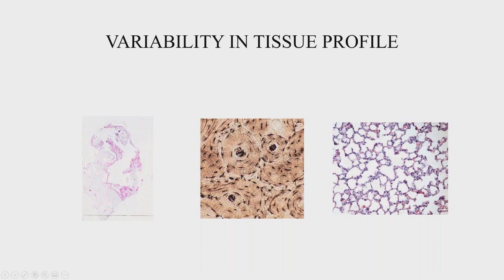Now I just showed you an example of compact bone, which on this slide would be right in the center. And you can see here in the center image the Haversian canal, or the vascular tube, right in the center of this big ring. I don't know if you all can see my pointer or not, but I'm going with the center image right now, and these concentric lamellae. You can see this circular development here from how the bone is forming, and you can see the smaller circle in the center.